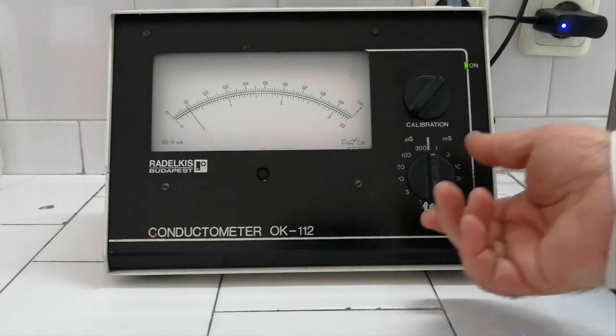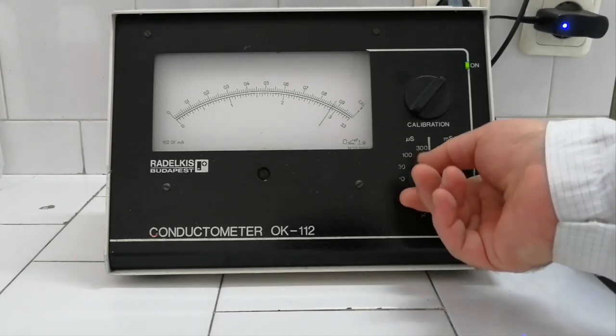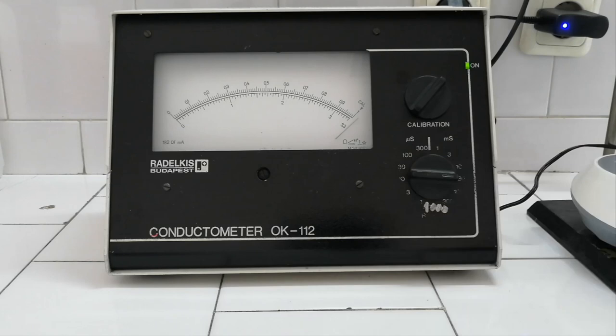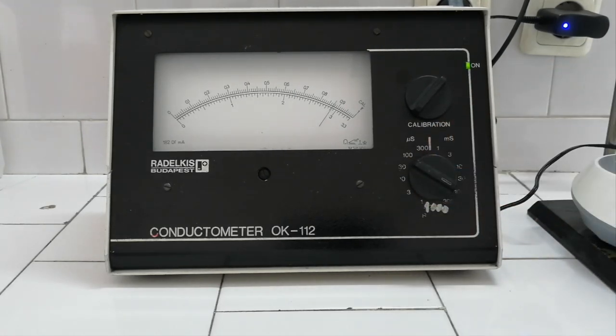Select the corresponding measuring range by rotating the range button counterclockwise. Continue to rotate until the indicator value exceeds the measuring scale shown on display. Go back one step on the range button. In this way, you find the range of maximum precision to measure the electrical conductance of this particular solution. If the measuring range starts with digit 1, you will read the conductance on the upper scale, whose maximum value will be 1, 10, 100 or 1000.